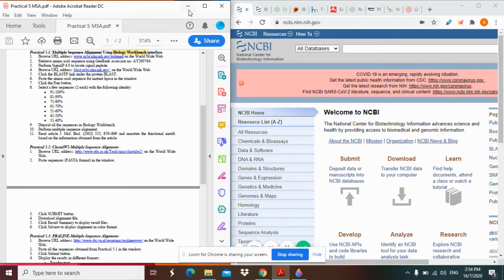Okay, so first of all, you search the accession number AY260764. Go to NCBI and search for AY260764. You click search.